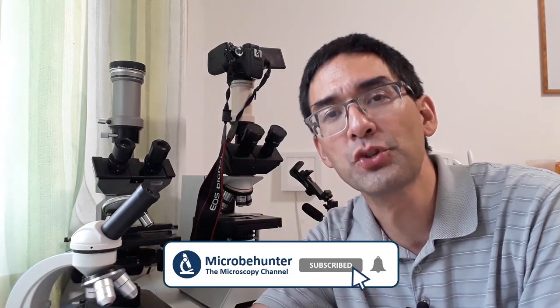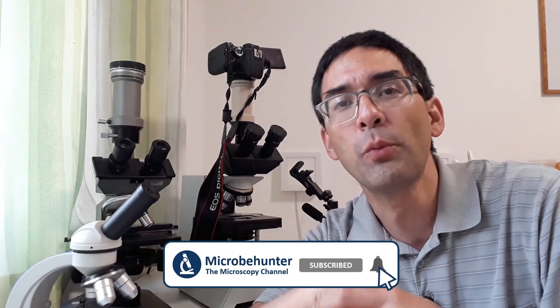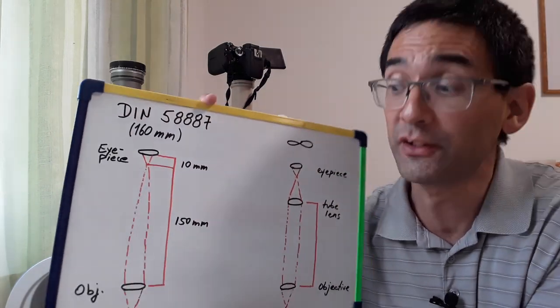But the very high-end microscopes from the big microscope manufacturers like Nikon, Olympus, Leica, Zeiss and so on, they often use the so-called infinity objectives and I simply want to explain to you a little bit what this actually means and what the differences and advantages are, and the disadvantages maybe.